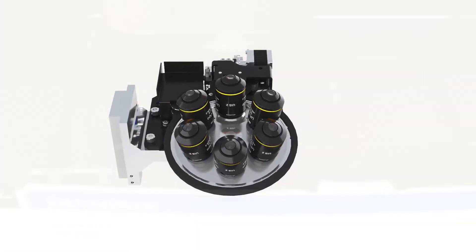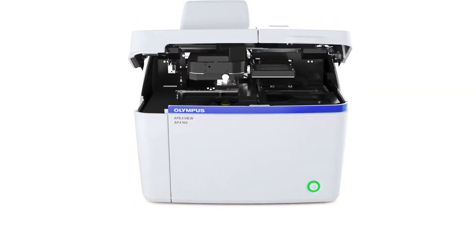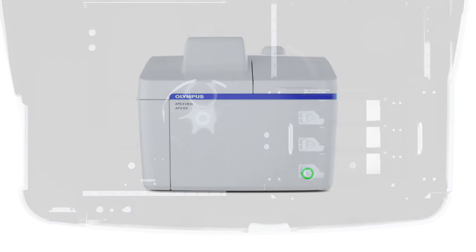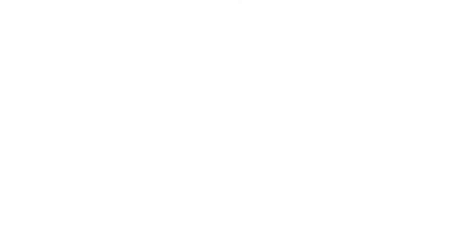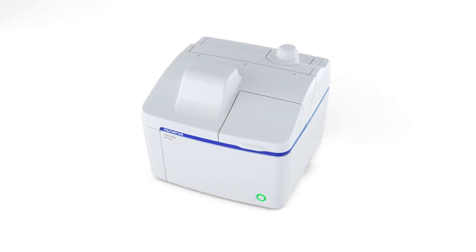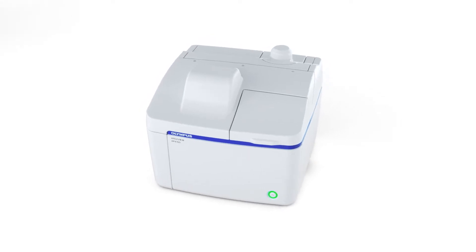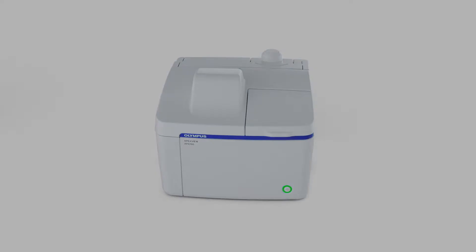The APX100 all-in-one microscope can save you time and effort by rapidly automating these pre-observation adjustments. And its box design means it can capture reliable fluorescence data anywhere, no darkroom required.